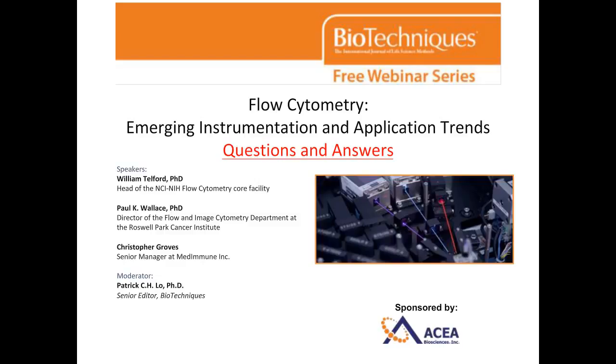Great, thank you. Our next question is also for you. Currently, cytometers require CS&T setups to allow voltage optimization to make results as standardized as possible around the fluctuations in laser and PMT efficiency. How will this be done with factory-fixed PMT voltages?